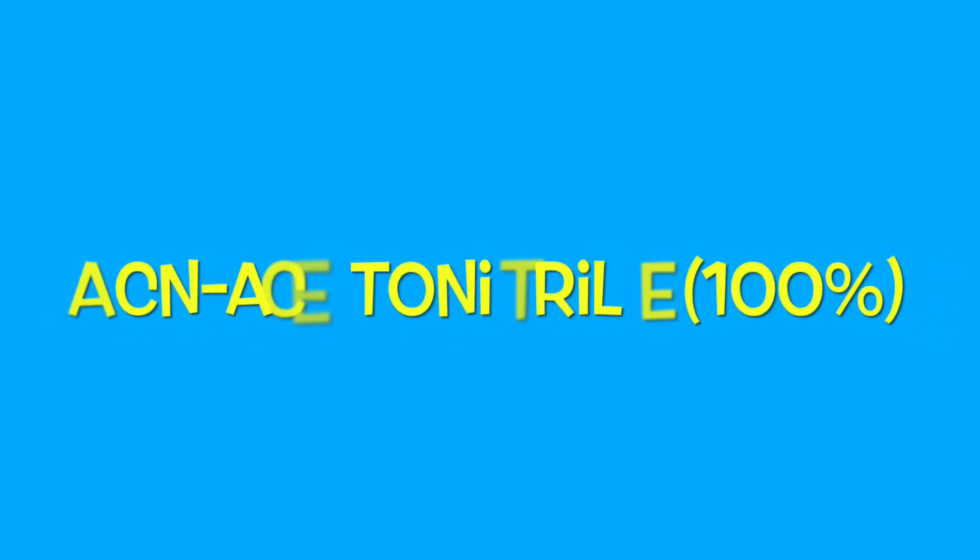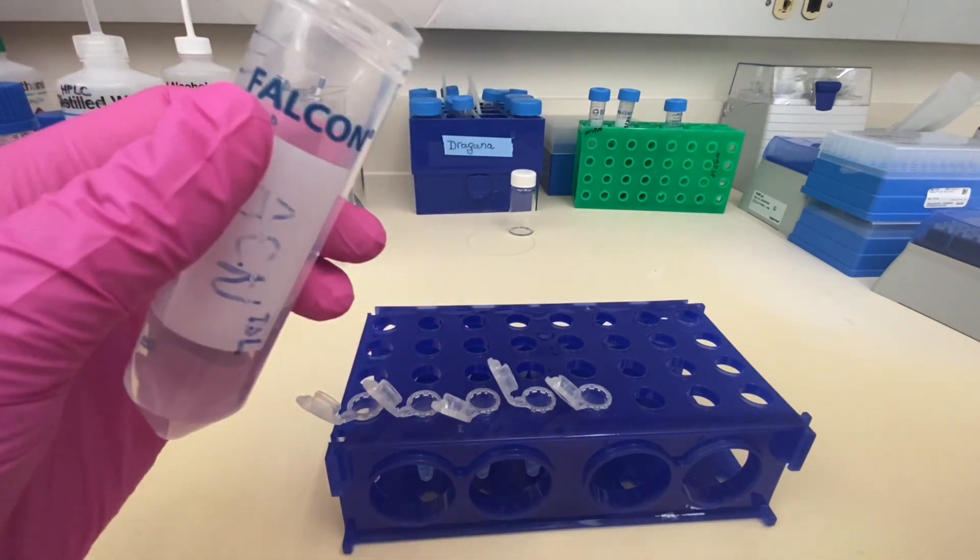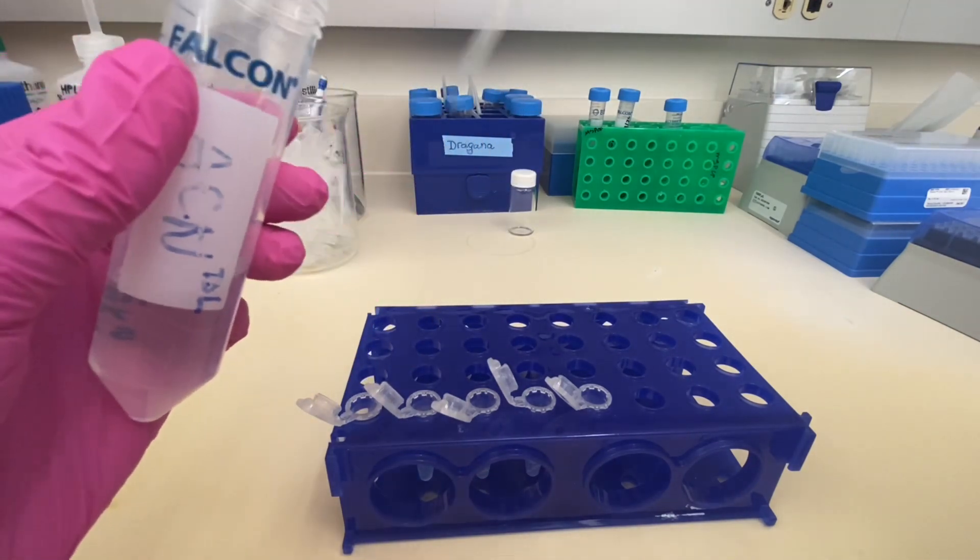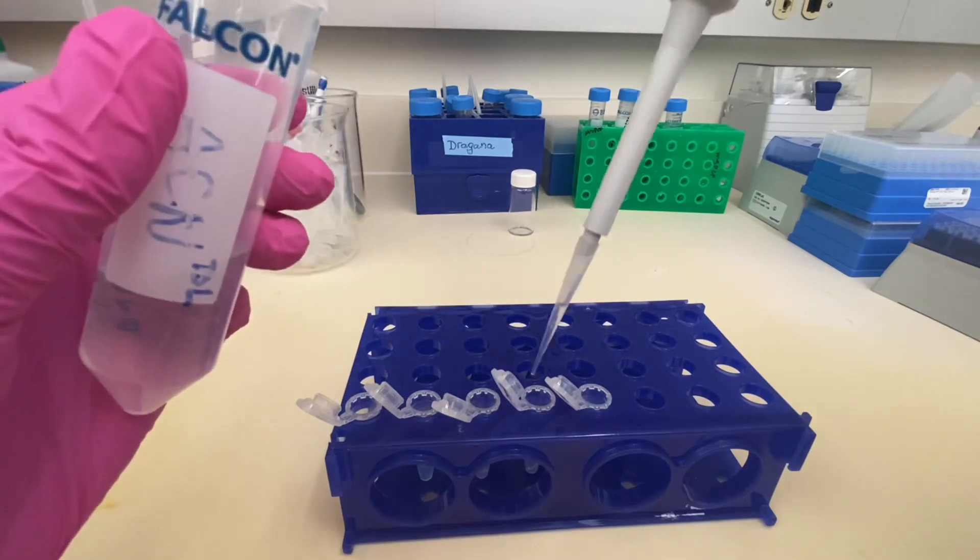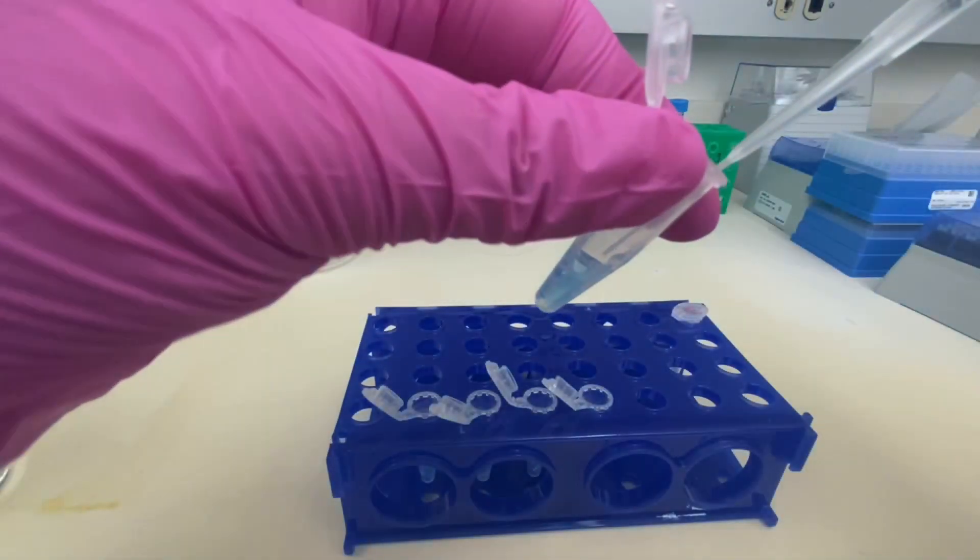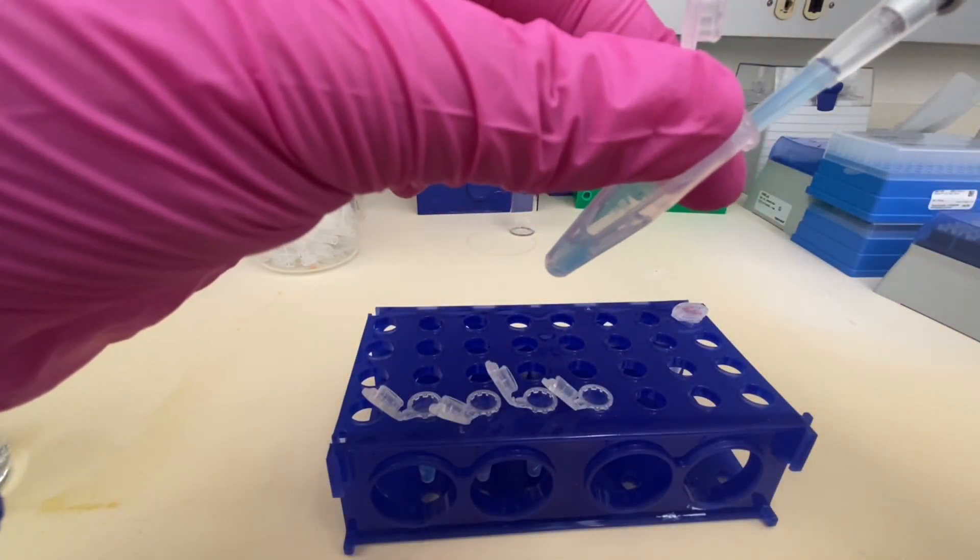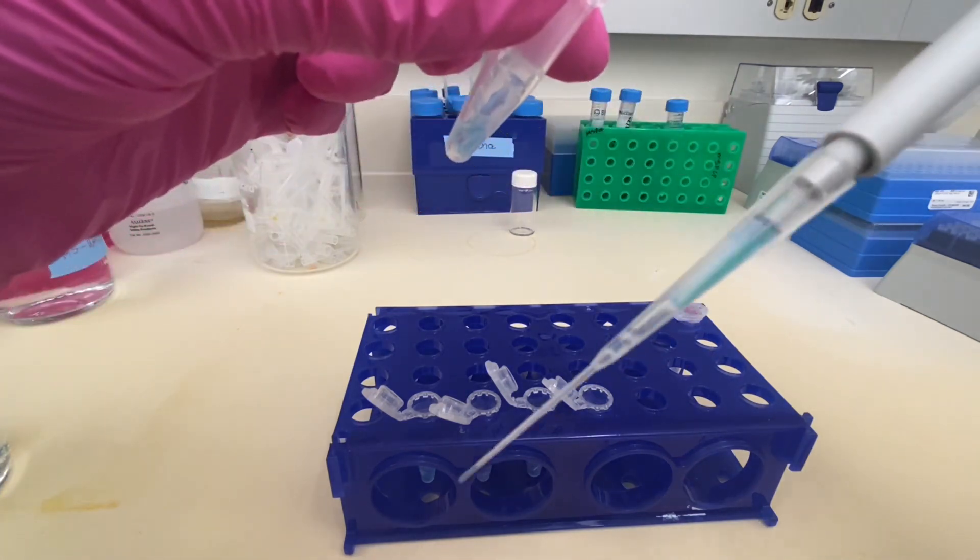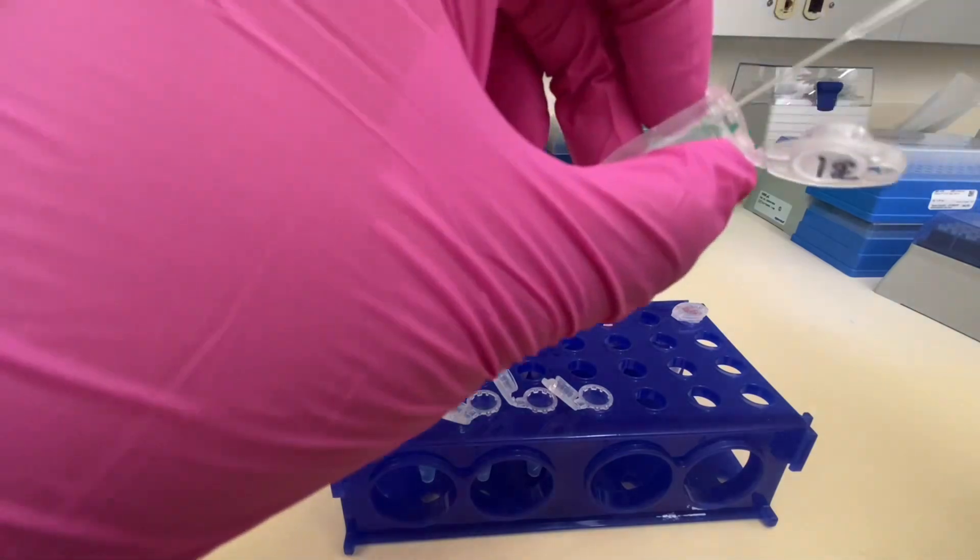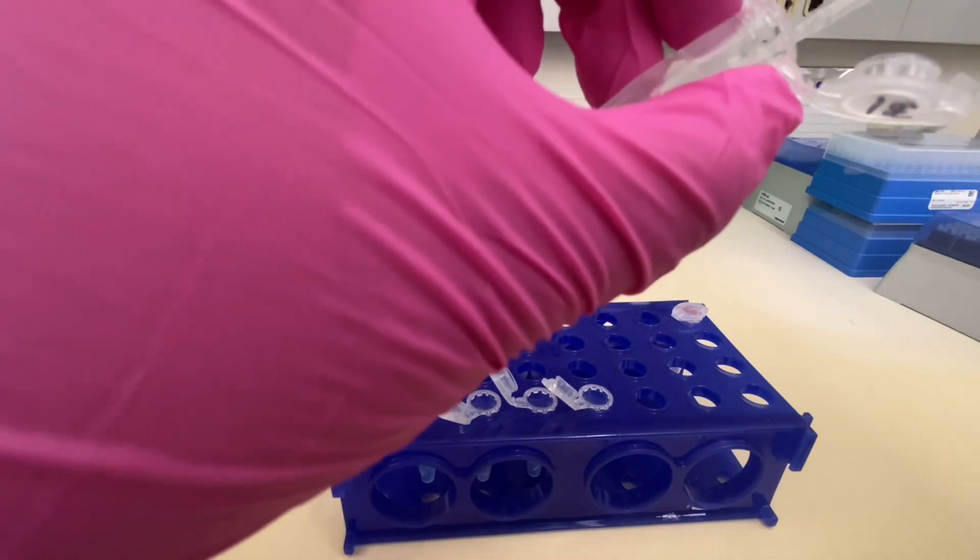The next step is adding acetonitrile, also known as ACN. So I'm going to add acetonitrile to each of my tubes and then I'm going to wait for 10 minutes. The reason why we add acetonitrile is because it's going to shrink our gels. Now I'm going to remove acetonitrile from my tubes and something amazing is happening here. As you can see my sample is blue, that means that acetonitrile will also destain my gels.